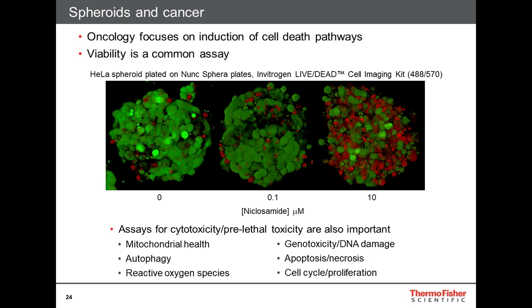So we see our cells going from green and healthy to red as cell death is initiated, and we see a dose-dependent response here.